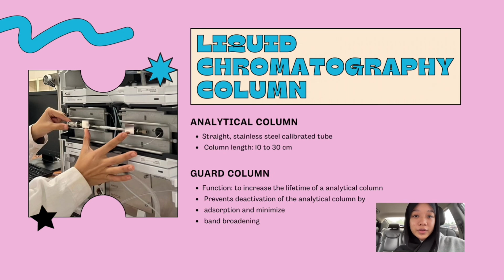Next, moving on to the liquid chromatography column. The analytical column is a stainless steel tube, usually 10 to 30 cm in length, and is responsible for separating the compounds. We also use a guard column which protects the analytical column. It helps prevent deactivation by trapping contaminants, and it also reduces band broadening, extending the column lifespan.